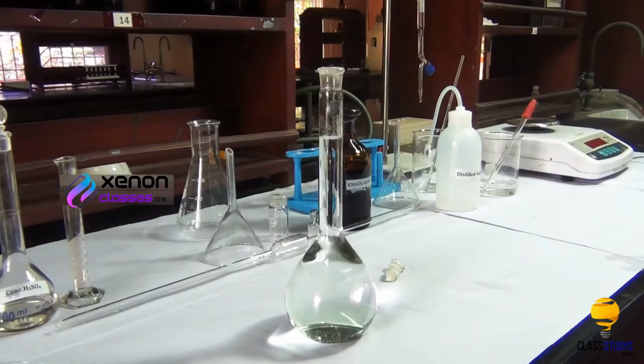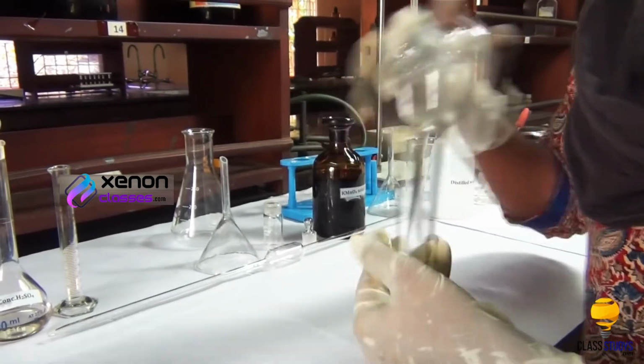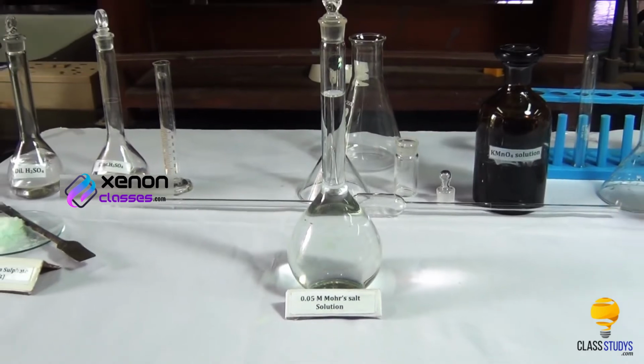To ensure uniform distribution of the Mohr salt solution, stopper the flask and shake it gently. We have now prepared a Mohr salt solution whose molarity is 0.05 molar.